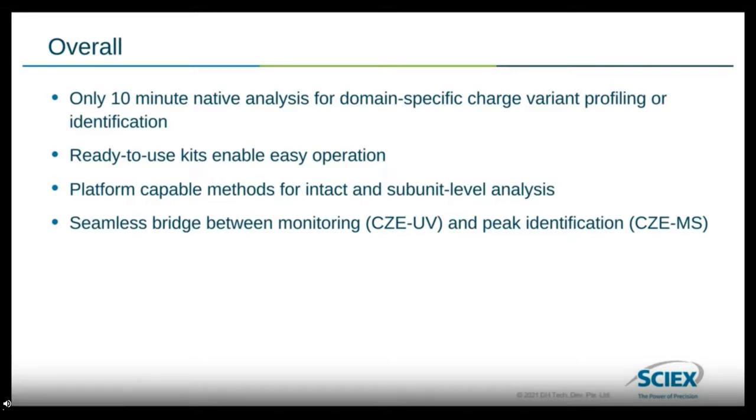The ZipChip is capable of analyzing intact molecules and doing the subunit level analysis. And there is a one-to-one comparison between the CZE with UV detection, which would be our CZE kit on the P800 Plus, and the peak identification using CZE on the MS, with MS detection.